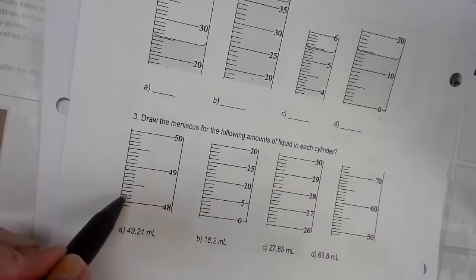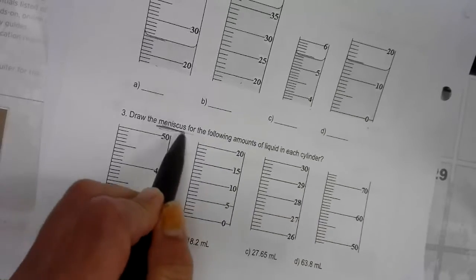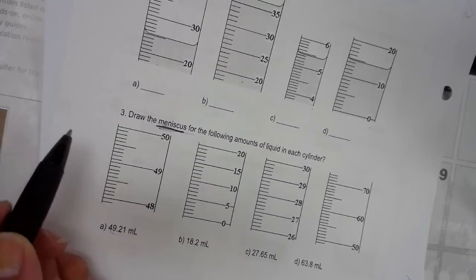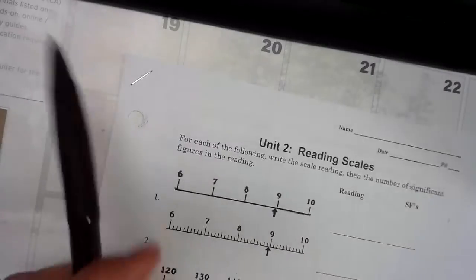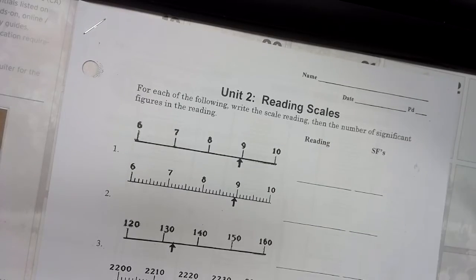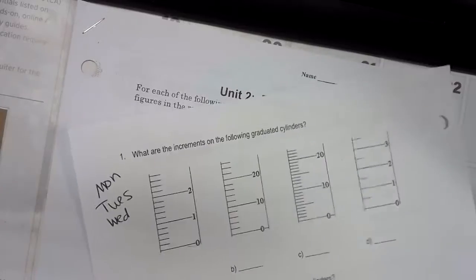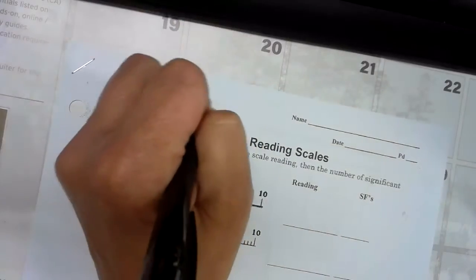Then down here, you're drawing a curved meniscus. That is the curvature of the water in a cylinder. I was going to try to highlight a couple of these. Then the actual homework is another set of stapled papers, and these are the reading scales. In the link in Schoology, you have these first 2 pages of notes, and then the next 4 pages are homework practice.